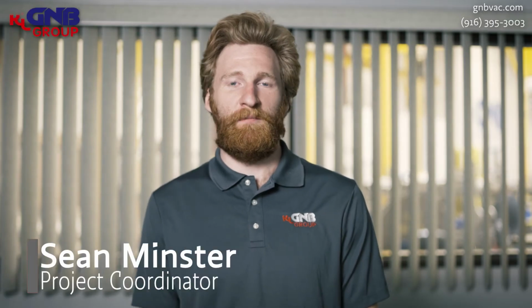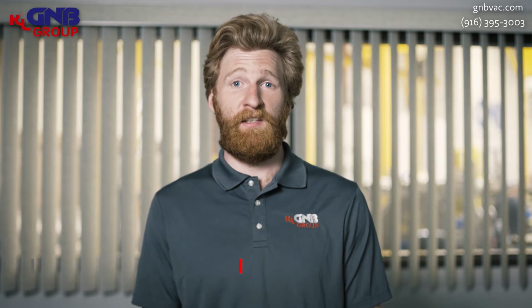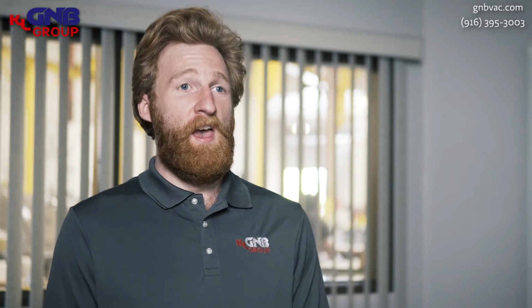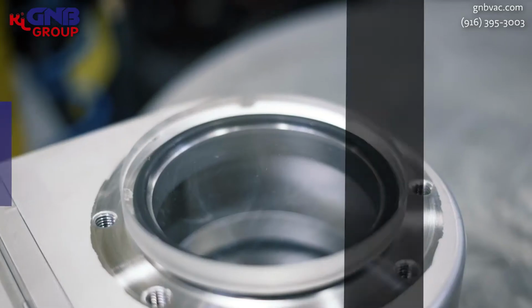Hello, I'm Sean Minster, the resident ASNT certified level 3 in leak detection here at GNB, and today we're going over how to interpret RGA scans.